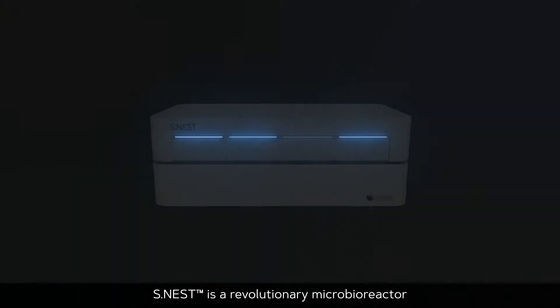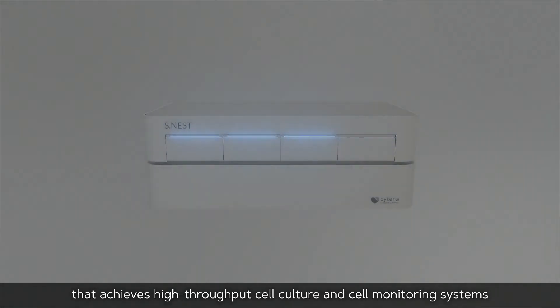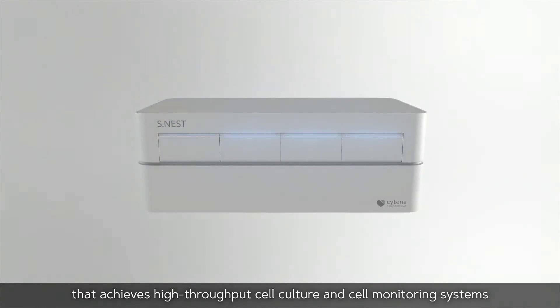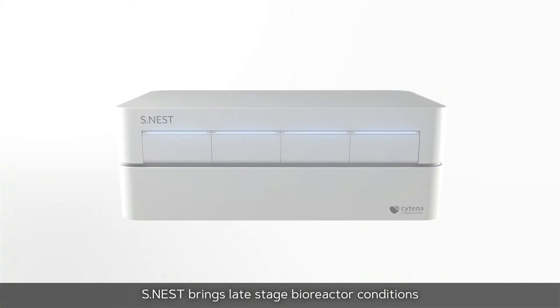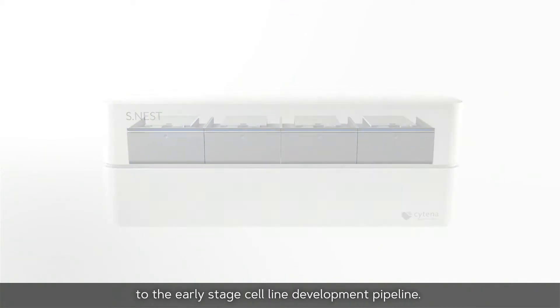S-NEST is a revolutionary micro-bioreactor that achieves high-throughput cell culture and cell monitoring systems in a micro-scale environment. S-NEST brings late-stage bioreactor conditions to the early-stage cell line development pipeline.